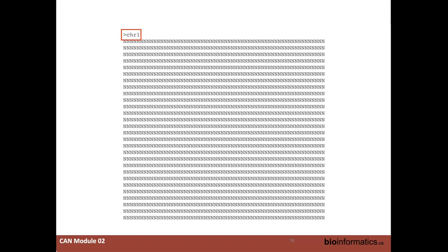This particular one happens to be for human reference. I believe this is GRCh38. So it's a reference 38. And the thing that freaked me out the most is, why are there N's all in the beginning of this sequence? Anyone know? Just turn off your mic and just yell it out, put it to me if you guys want. Oh, I saw people have some hands up.